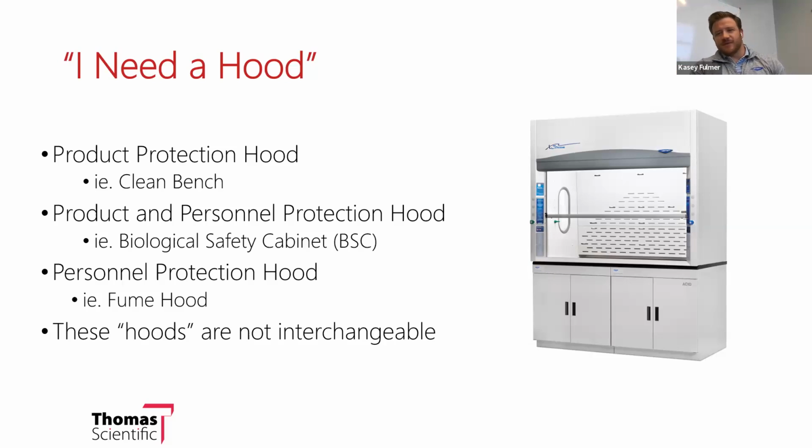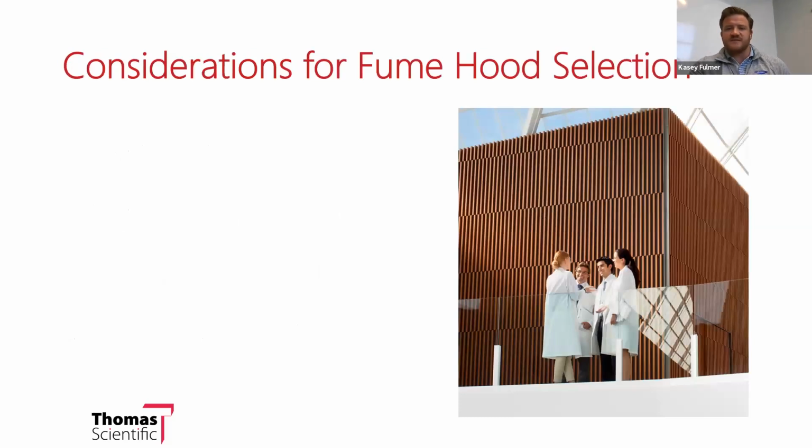I'll keep going. Similarly, if you were handling some biomaterial that does not disperse whenever you exhaust it, identifying the right product is very, very important. So for fume hoods, if you're using a vapor, gas, fume, aerosol, anything like that, a fume hood is very likely the way to go. And there's a lot of things to consider in your fume hood selection, and we'll cover those next. We have things like materials of construction.